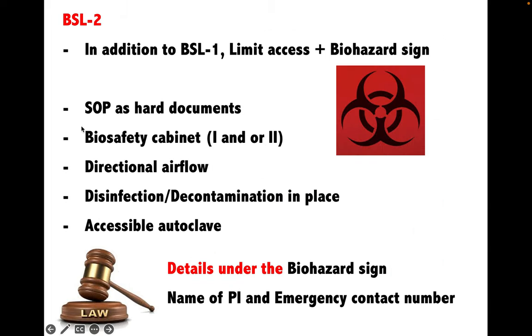In addition to BSL 1, BSL 2 must have limited access, clearly displayed biohazard symbols, on-site documentation of standard operating procedures or SOP, and biosafety cabinet class 1 and/or class 2. The ventilation must be directional — air coming in and out of the laboratory must be controlled in only one direction. There must be a designated place for decontamination, an autoclave in an accessible area, and emergency contact details and the head of the laboratory must be displayed under the biohazard symbol.